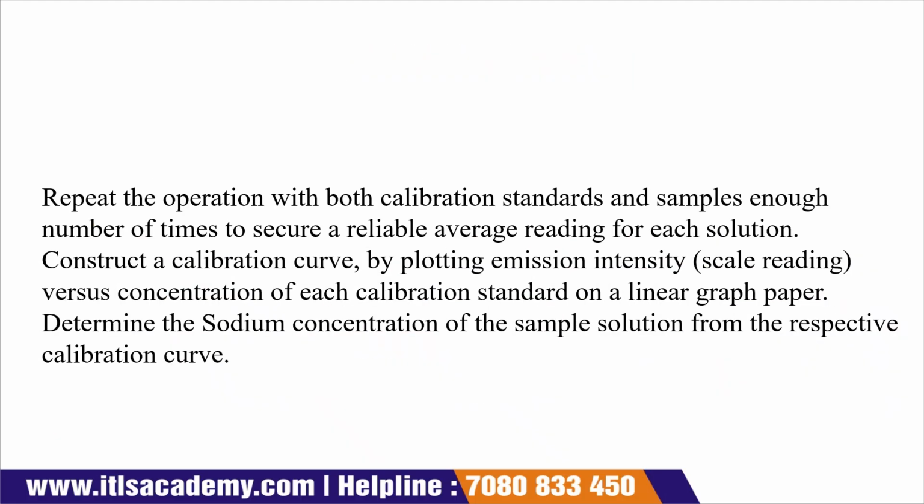and working towards the most diluted standard, measure emission at 589 nanometer for sodium in a spectrophotometer. Then repeat that operation with both calibration standards and sample enough number of times so that we secure a reliable average reading for each solution. So we repeat the operation for both the calibration standard and the sample, so that we get an average reading.